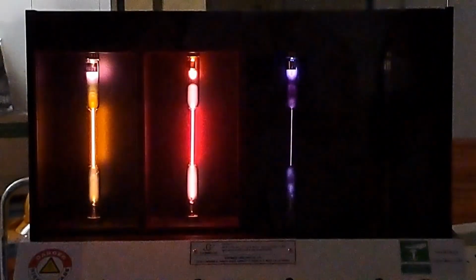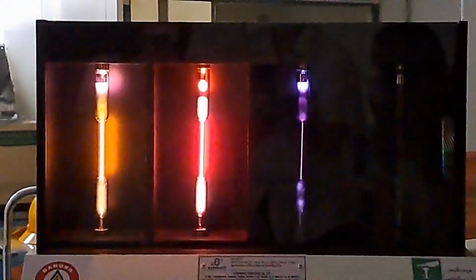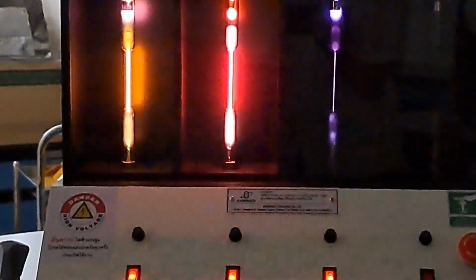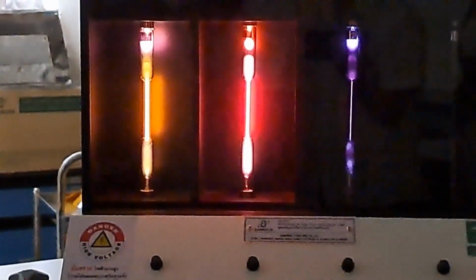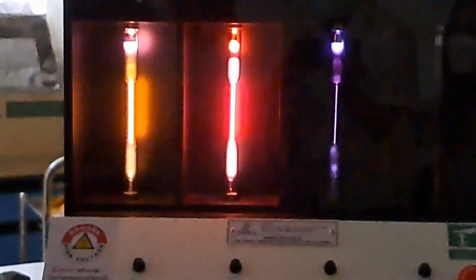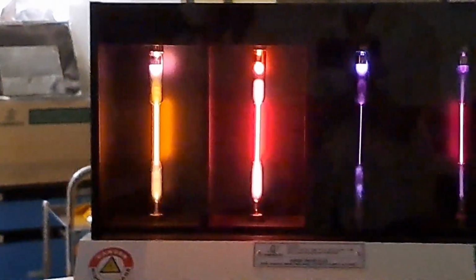I recorded too many frames per second, so it's flashing. It has to match: 50 hertz, this 60 hertz. If it doesn't match, it flashes. It's been recording 40 minutes now. Oh, here is the hydrogen gas.